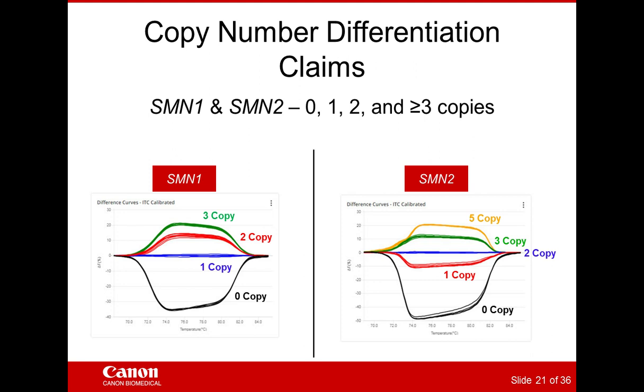As I had mentioned when we were looking at the protocol differences, investigating higher copy number changes and picking up the differences between, say, 5 versus 6 copies of a gene is more difficult. The fluorescence change between the 2 is much smaller than, say, 2 versus 1 copies of a gene. In reality, you should have around 50% fluorescence difference between 1 copy versus 2 copies.